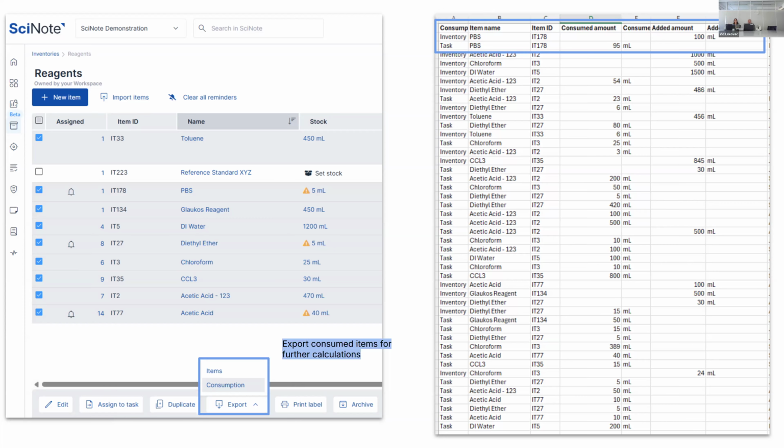Thank you. Good. Keeping inventories up to date. So this one is tricky. I know a lot of you answered that this is a big challenge, both today and in the previous webinar. But I think it's very connected to all the other challenges: keeping stock, tracking consumption, being compliant, sharing inventories. So keeping inventories up to date, I think, is an umbrella term. It covers all of these.